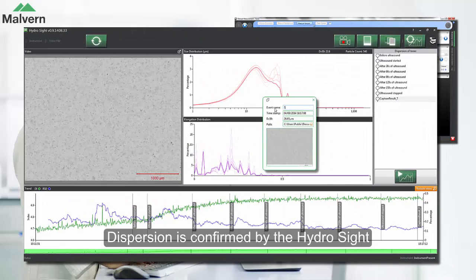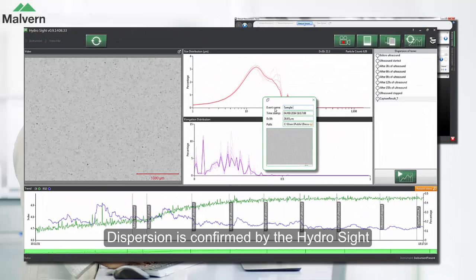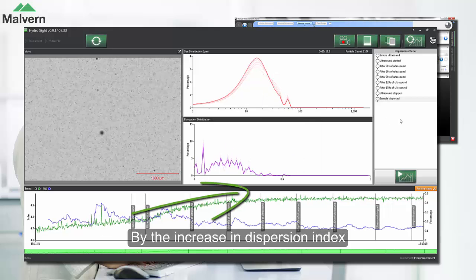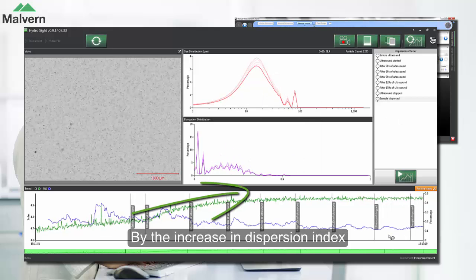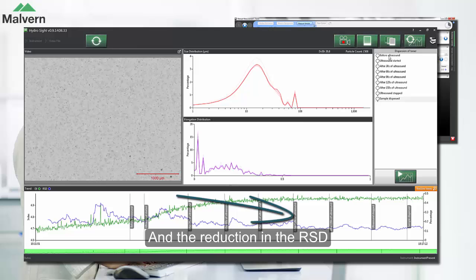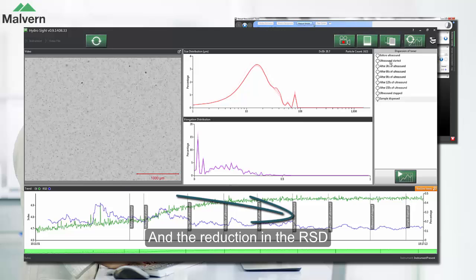If we review the HydroSight software, the dispersion is confirmed by the increase in the dispersion index and the decrease in the relative standard deviation.